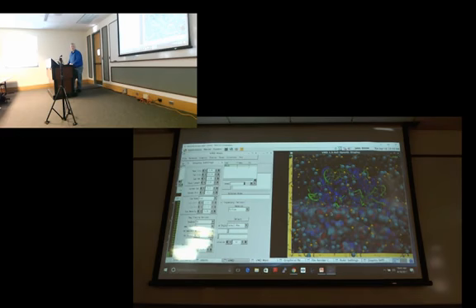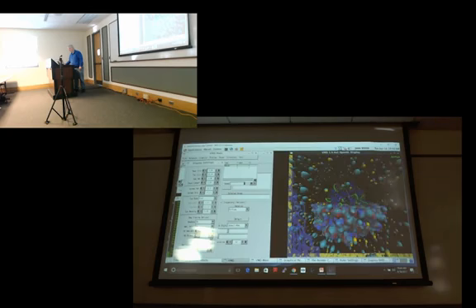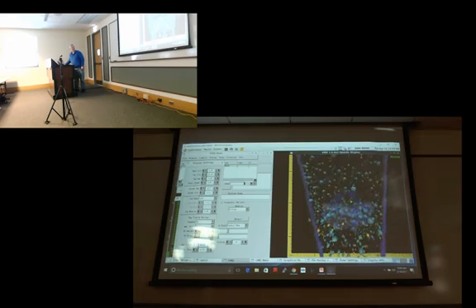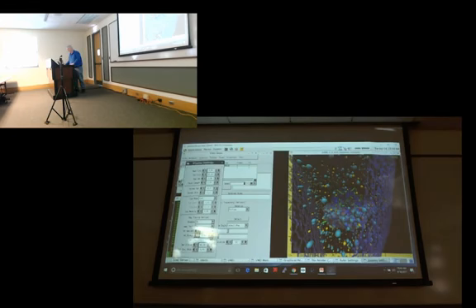But the only way to really understand if you are doing the right thing, choosing orthographic or perspective, is to try. Yeah. Try, change your view, change your perspective, and say, okay, this way I show what I want to show. But the easy thing is, if you want a wider field of view, make screen height bigger. If I make it really large, now you can see it's super distorted. And you have eggs. Yeah, that's Egus Maximus, right? It's super distorted, but we would never do that.